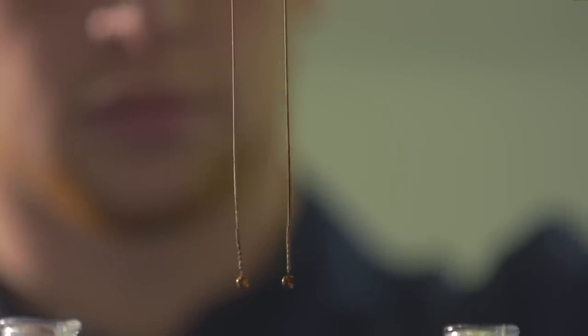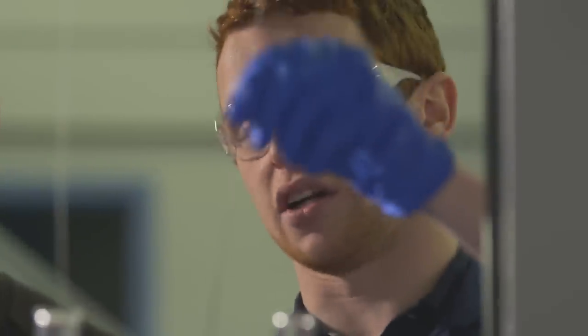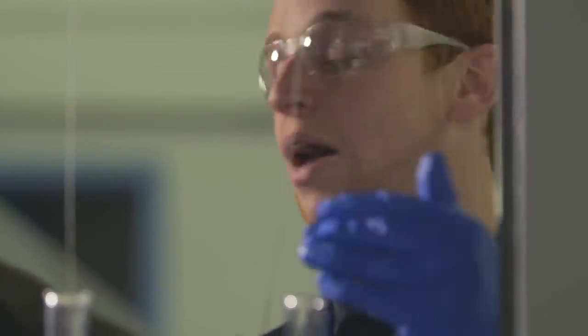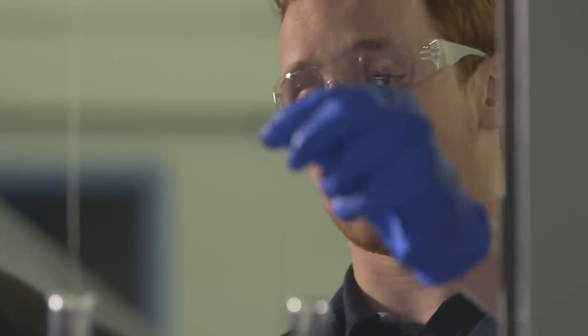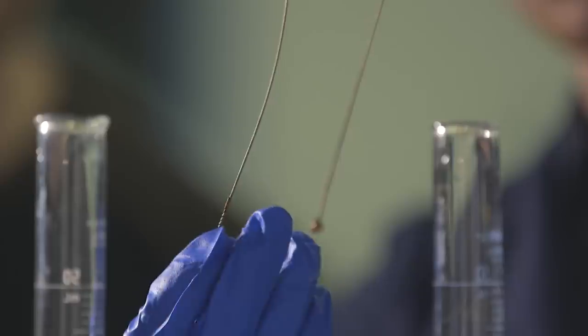In your estimation, is this a pretty substantial difference? I'd say the level of corrosion, evidenced by the darkness of the red rust along the wire and the amount present up the length of the wire compared to Paradigm—they're really not comparable.